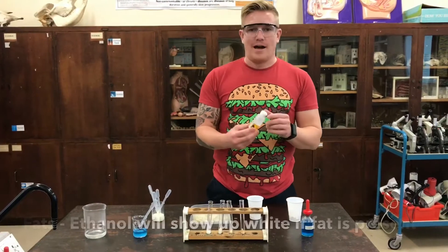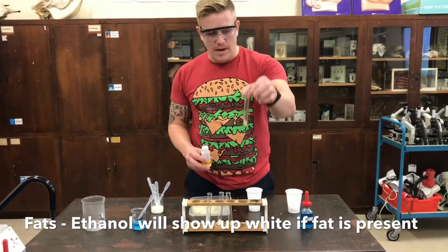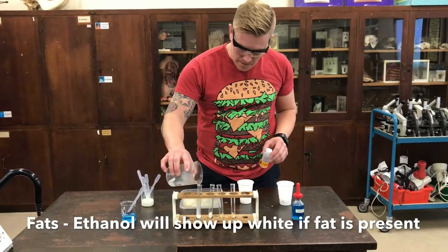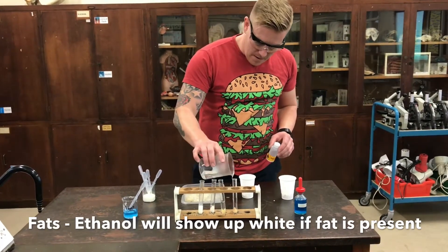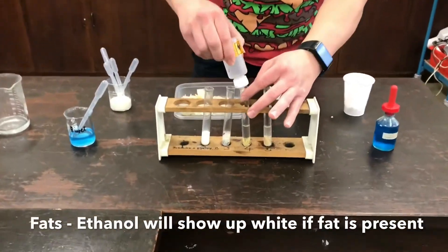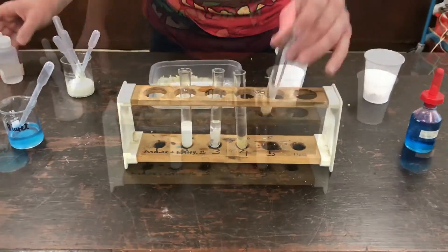Next I'm going to test for fats and I'm going to use ethanol. As you can see I've prepared in a test tube all my foods. I'm going to mix a little bit of water with this just to get it started, just to help that fat break down so we can witness it. I add a drop of ethanol to each sample and mix them up.